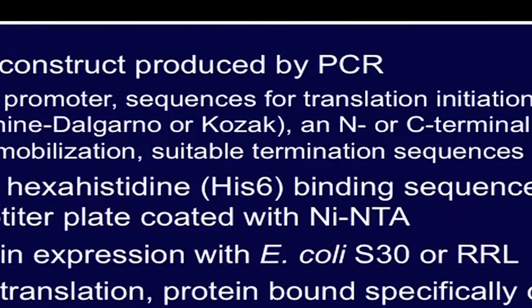Let us first discuss protein in situ array, or PISA. It is also known as discrete array technology, which provides a rapid single step method to generate protein arrays from the DNA template by using a cell-free transcription and translation system, which allows immobilization of synthesized protein on a solid microarray surface.